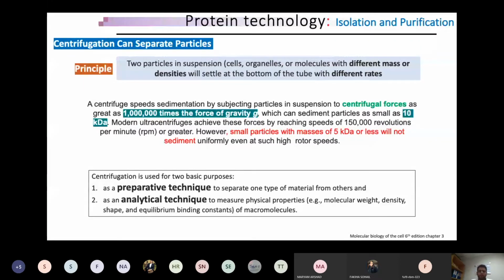So you have a protein, and you centrifuge that in a centrifuge machine. And what does that mean? It gives a centrifugal force, and centrifugal force is the force which pulls things to the outer side. So it will pull you to the outer side, and you have a rotor down here to which this is attached. So the greater the molecule, the further it will go down.